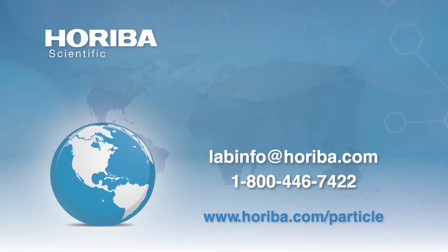Can the system be used to size submicron oxide particles? Submicron oxide? Oh yeah, they scatter very well. In fact, we can go below that. I mentioned that 50 nanometer number earlier, but if you start looking at things like oxides, we get down to smaller sizes. I know when we talk about NTA, a lot of times we focus our applications on life sciences, but this is definitely an instrument that's very compatible with oxides as well. It's been used with metals, with oxides, and with coatings, which are basically polymeric nanoparticles.